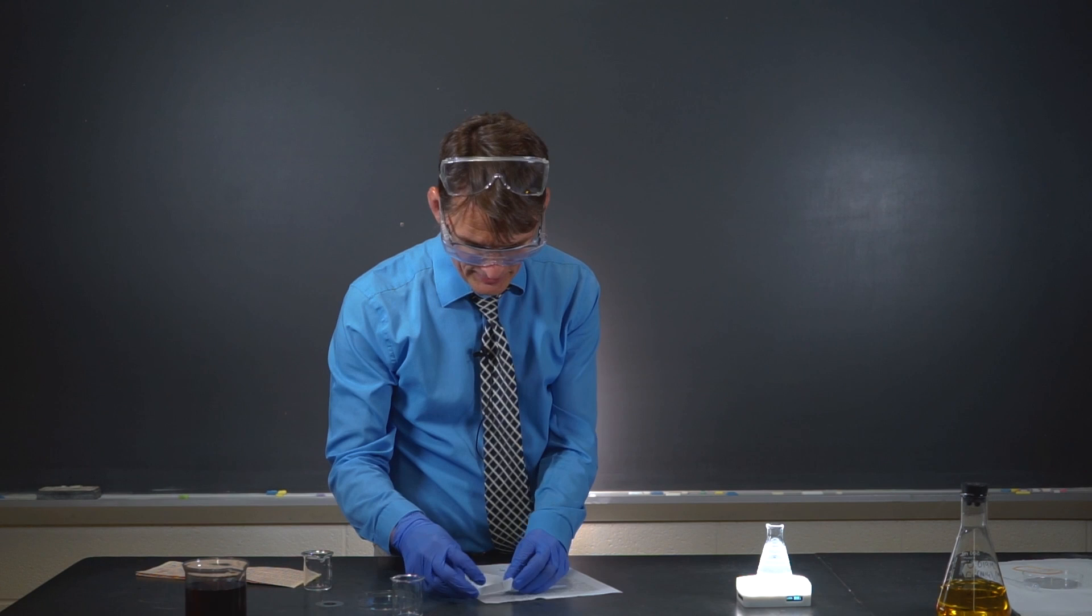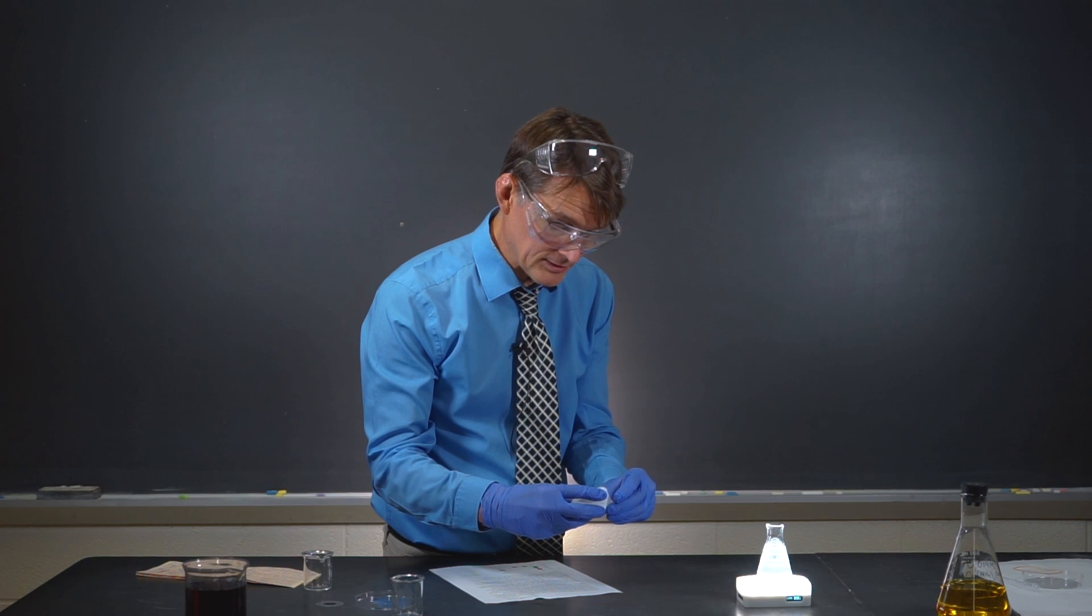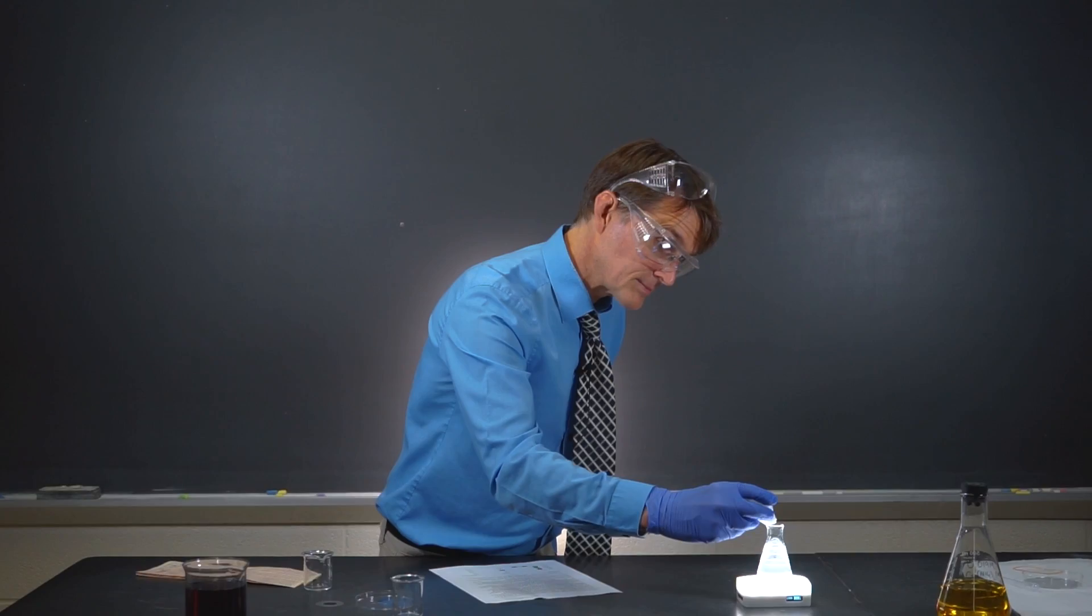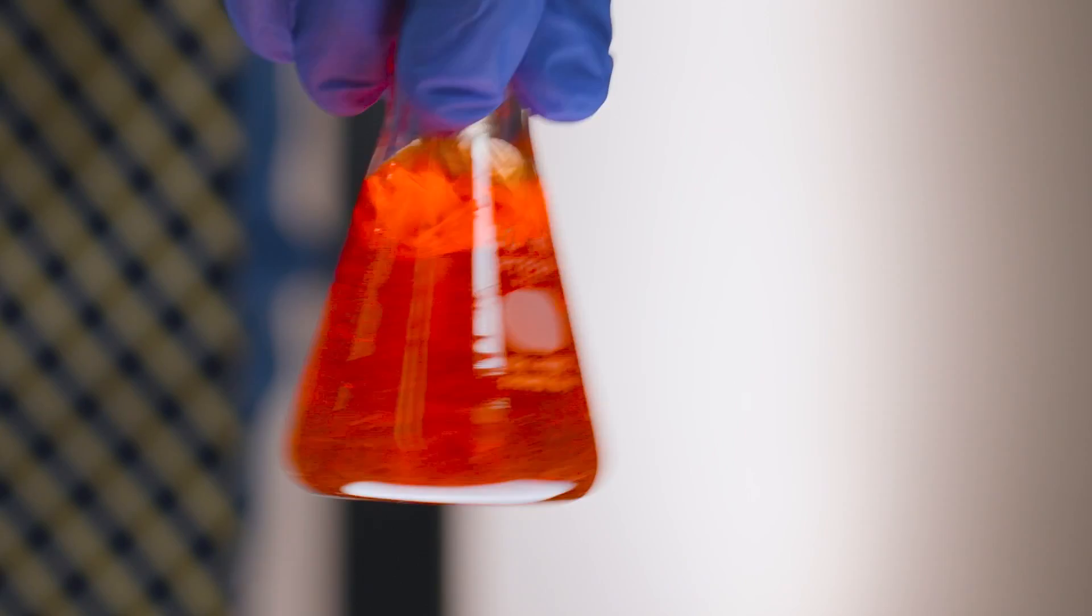So this has iron ions dissolved in it. Now we're going to add the iron indicator called ferroin. And ferroin is going to be red in the presence of iron 2 and blue in the presence of iron 3. Just pop this in, see what happens. So that's pretty easy to tell that we've got iron 2 in this solution for sure. Look at that beautiful red color. And there's our indicator.